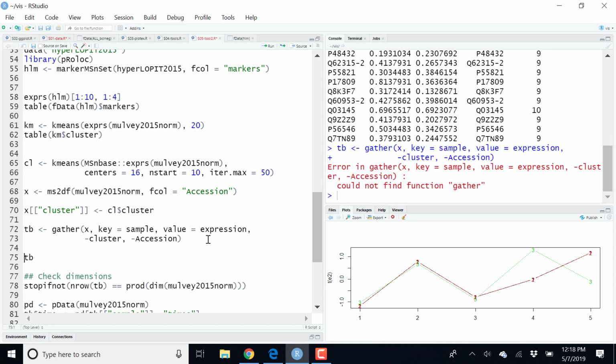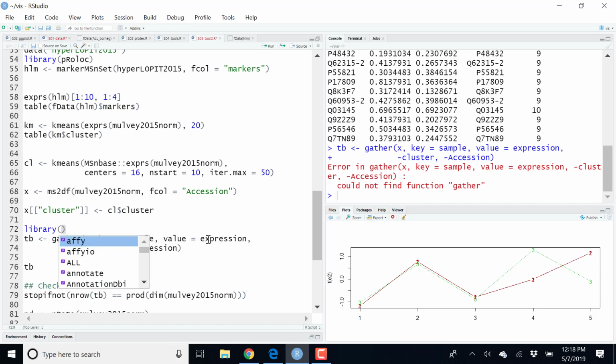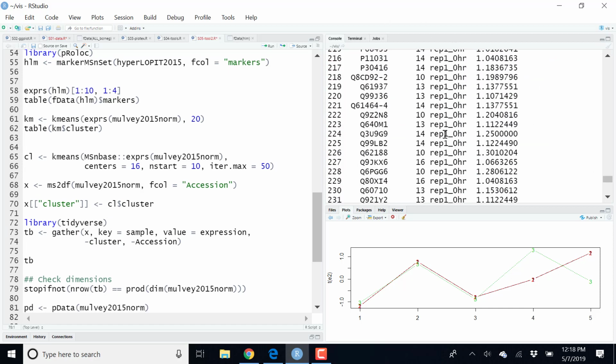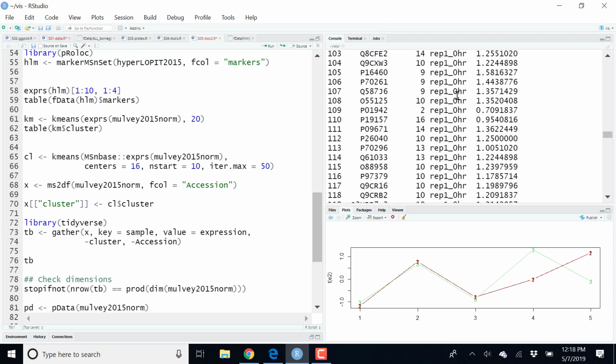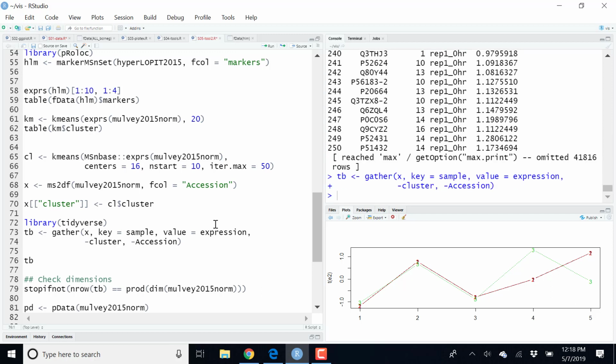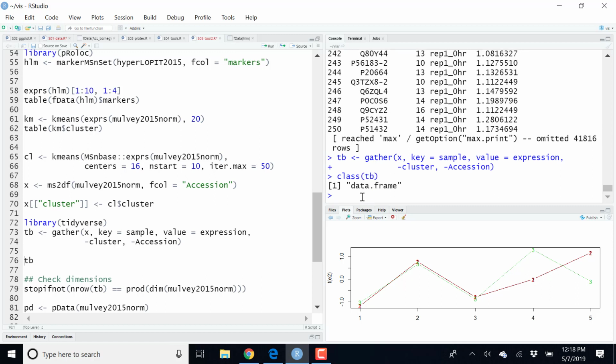And then here I now gather my data. Oh, interesting. So now it is still a data frame. Aha. Okay. That's weird. Oh, it's not weird. It's different than what we had this morning.